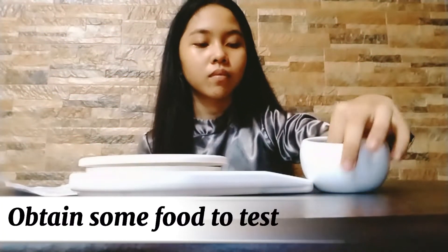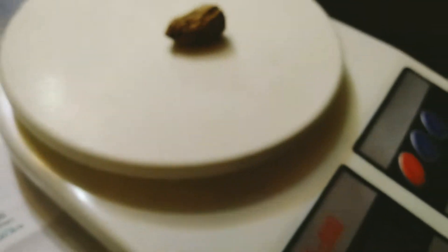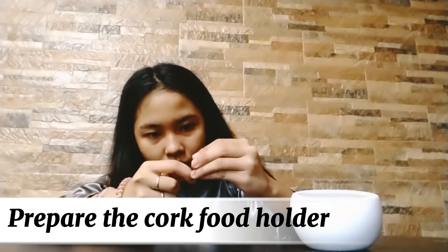Obtain some food to test. Weigh the food using an accurate scale and record the measurement — you will only need a small amount of food, for example a shelled peanut. Prepare the cork food holder by carefully wrapping the end of the needle around the food you will test.